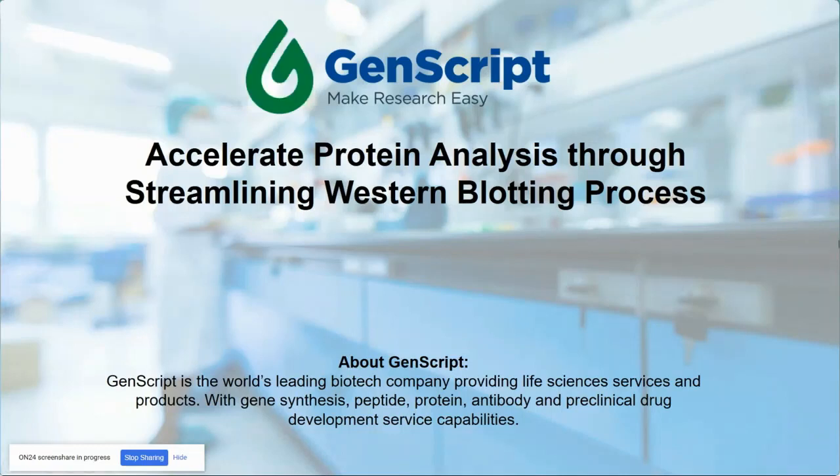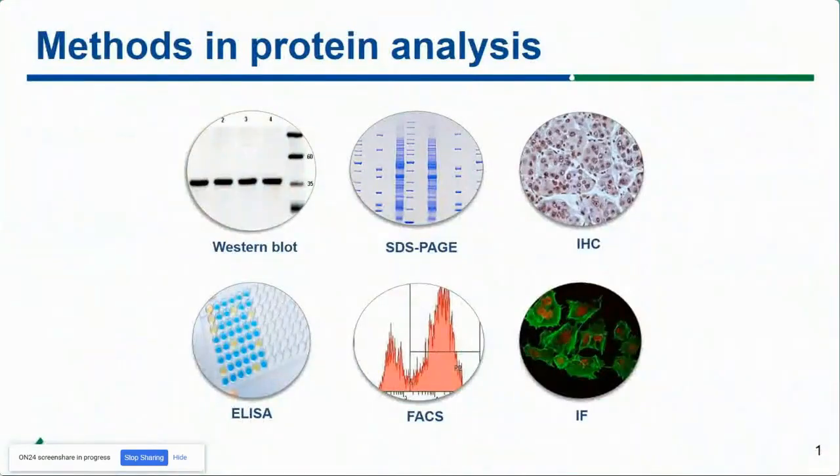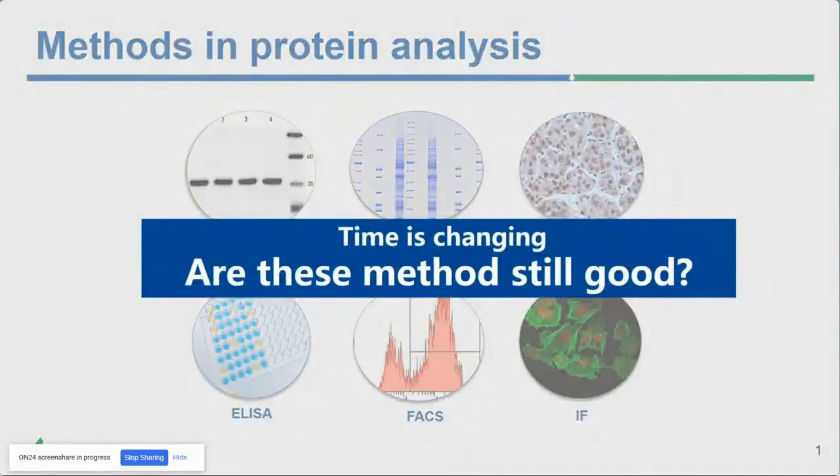So today we'll talk about what we did for protein analysis, as it's a very common technique we use in laboratories to research regulations of different processes. Well, there are many different techniques when we are studying proteins, and here are some of the very common ones. We're trying, as in our model, to make research easier. One of the central topics today will be Western blot, a very staple method in many labs. I think you might have used it in your research as well.